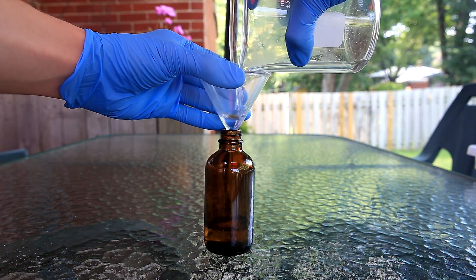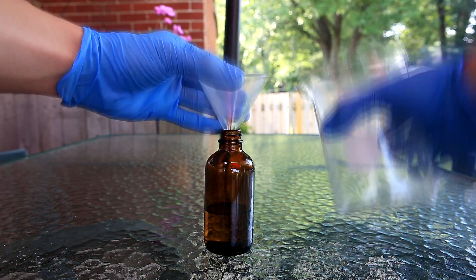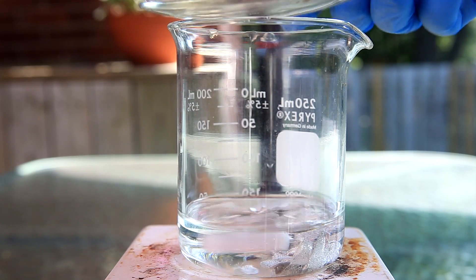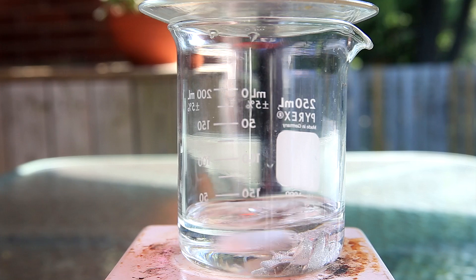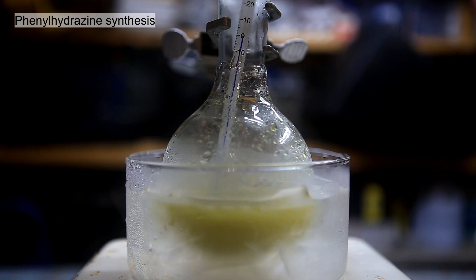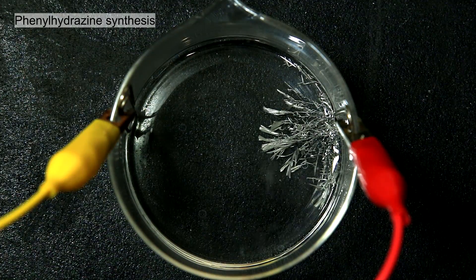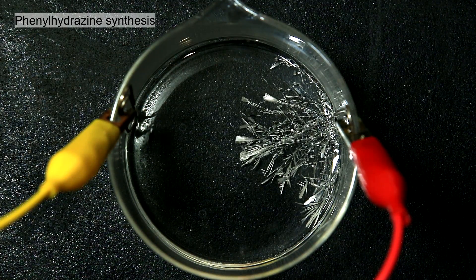Tin(II) chloride, also known as stannous chloride, has a variety of different uses. One very common use of stannous chloride is as a reducing agent. I plan to use the stannous chloride solution for the synthesis of phenylhydrazine and also to electrolytically grow some tin crystals.